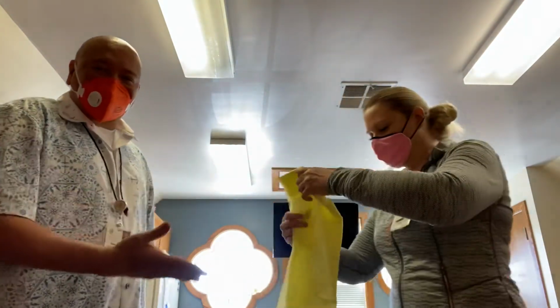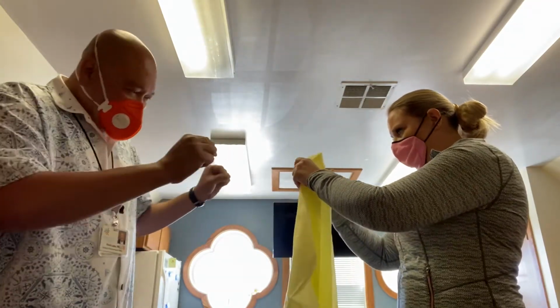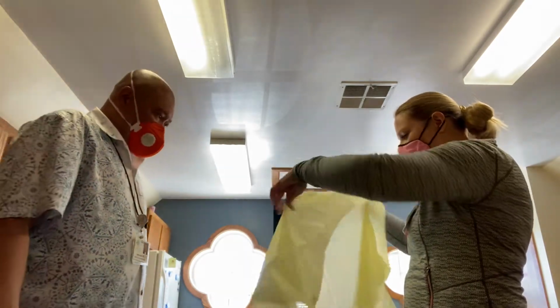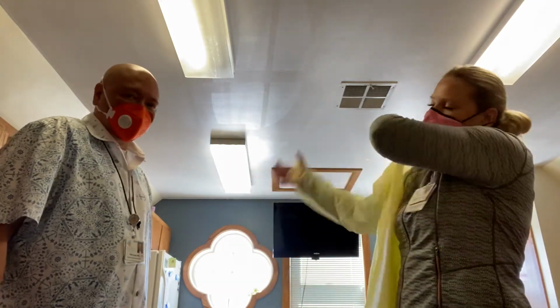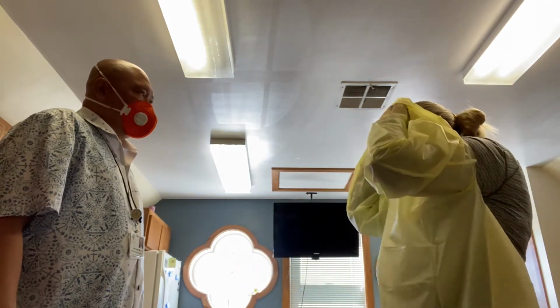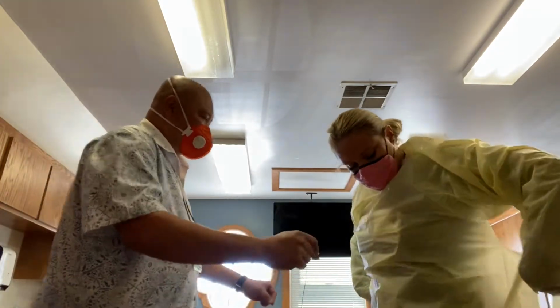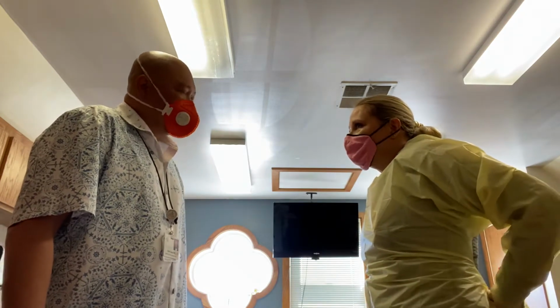So Elizabeth is checking her gown for rips and tears to make sure that it is a very good gown, to make sure that there's no leaks going through. Applies her gown. And then we make sure that we seal from the back so it's tied up. We should all be able to do this ourselves. If we have additional staff, they can double check.